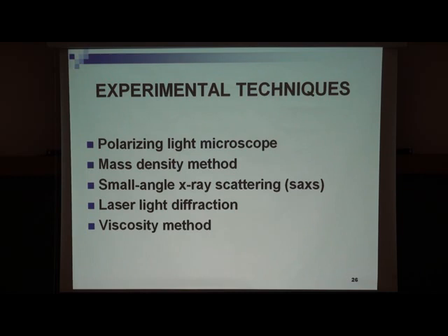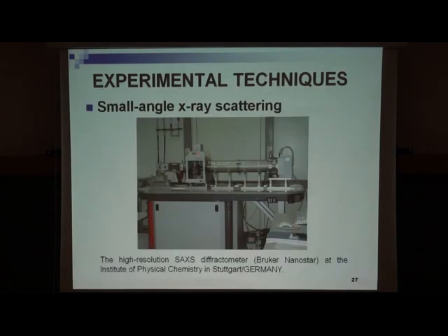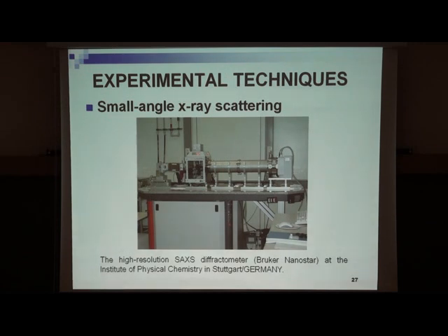And viscosity method is used to evaluate the intermicelle interaction parameter, which is called the Huggins constant. And we used small angle X-ray scattering, Bruker Nanostar. It is similar in this group.